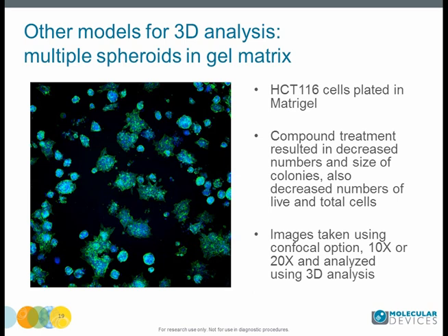In addition, I would like to briefly describe another model. A similar approach was taken for imaging and analysis of spheroids in semi-solid media. Images were acquired using the confocal option. These slices were captured 5 to 10 microns apart.